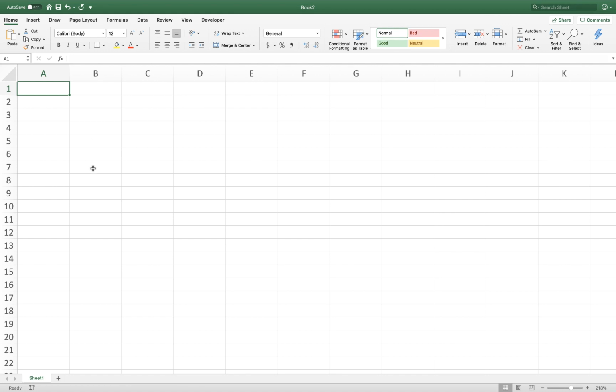I promised I'd teach you folks how to use Excel. We didn't have time in class, so I'm going to do a quick screencast here now. Excel is a spreadsheet software. It uses cells instead of, for example, the page layout of Microsoft Word, and in these cells you can enter numbers and text. You can perform math on those cells, and you can also input data in order to create visualizations like graphs. I'm going to teach you exactly what you need to know for this lab.